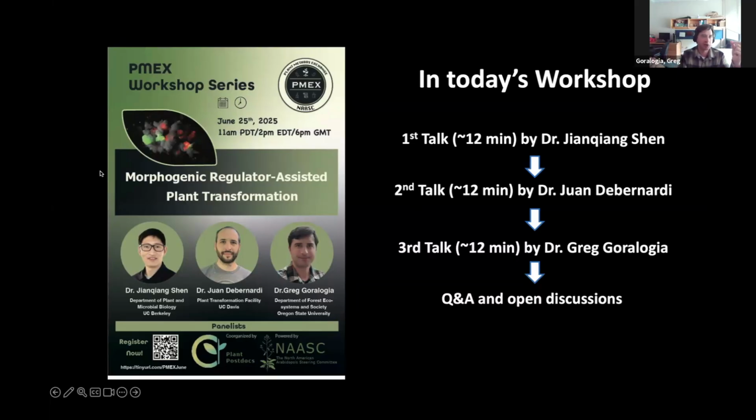And antibiotics like hygromycin that are really strong in the callus phase are going to negatively impact the morphogen-only integrated cells. And so the balance of those is actually quite critical. Sulfadiazine, I think, is another one in the same class, but I think the Wisconsin Crop Innovation Center in dicots is using spec a lot now too.